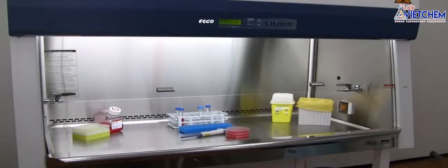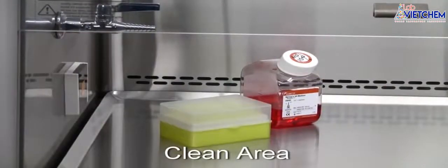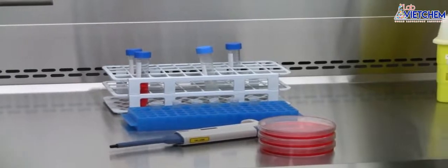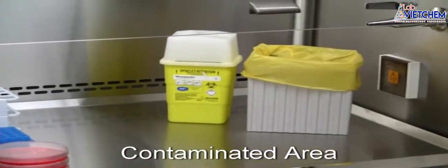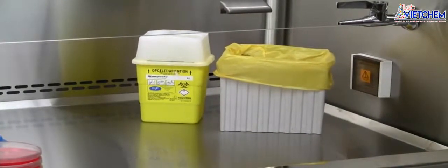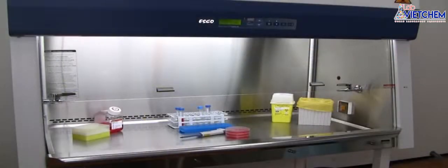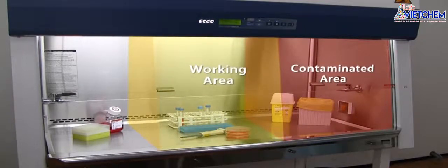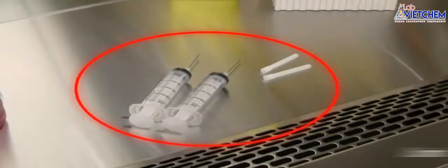The biosafety cabinet work zone should be divided between 3 areas so that you have a clean area, a working area, and a contaminated area within the work zone. These areas must be located to minimize movement of clean items over contaminated items and vice versa. Place your waste containers in the contaminated area. Place your working equipment and specimens in the working area, and your supplies should be located in the clean area. Transfer materials from the clean side through the work area to the contaminated side.